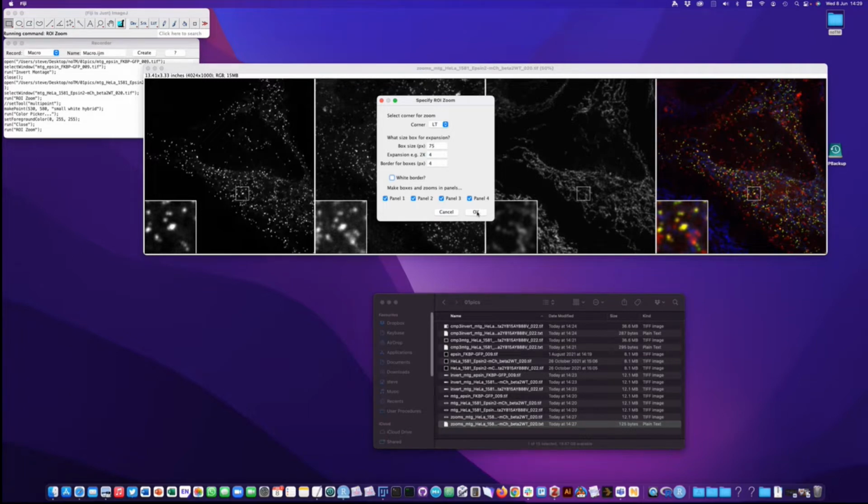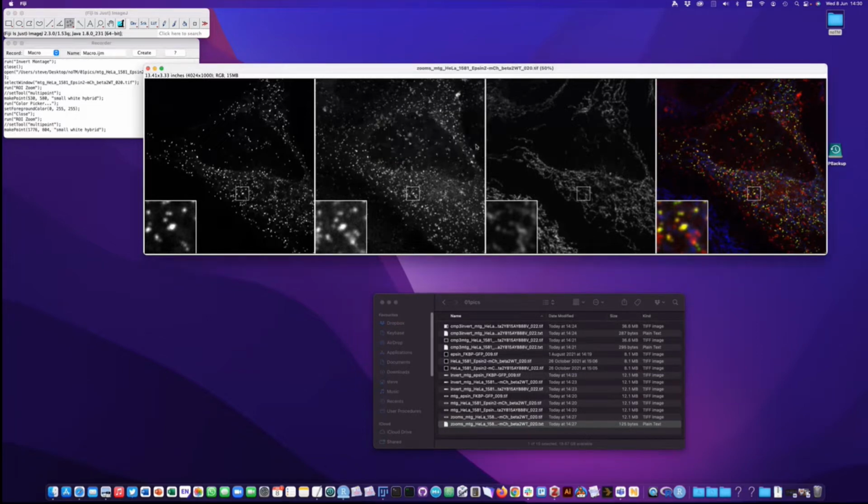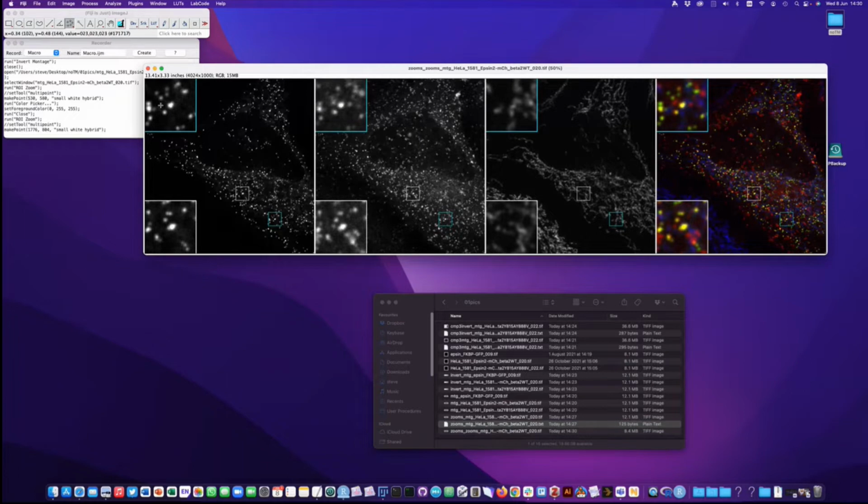Now when I click OK, we can just specify this. Oh, let's go for this guy here and click OK. And now we get another highlighted one, which is sort of color coded. So it helps the reader to quickly see what's going on and why these 2 spots might be interesting.